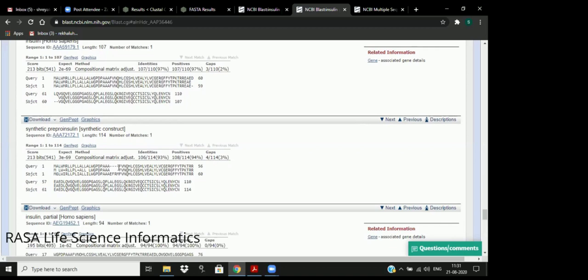So in this 1 2 3 and so on continuation, you see that even though it is not 60, it is 56, because they have thrown the gap in the middle, right? But that does not matter to me. Why? Because I don't have anything to worry about those gaps, because I am here to predict the data for the subject, not the query.